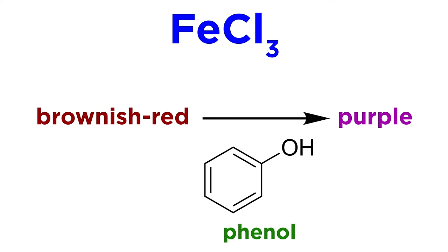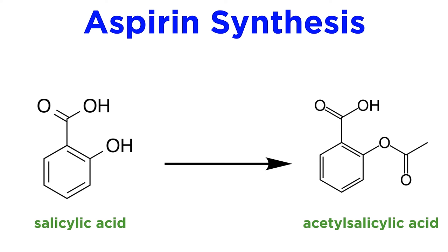To do that, we'll use iron-3 chloride. This compound changes color from brownish-red to purple in the presence of a phenol ring. Now, let's look at our starting material, salicylic acid, and our product, acetylsalicylic acid. Which one has a phenol ring? As you can see, salicylic acid has a phenol ring, and aspirin doesn't.